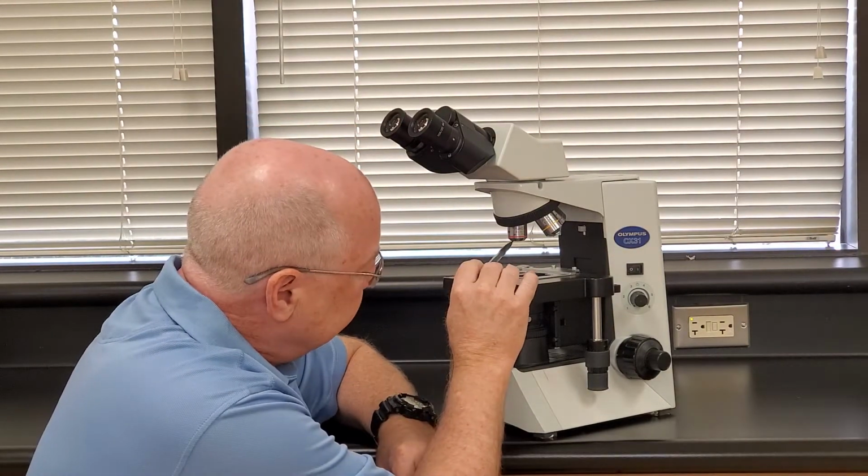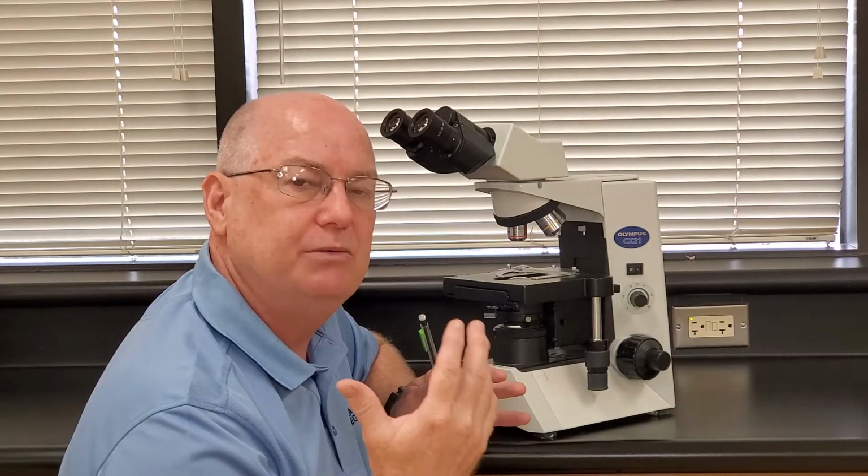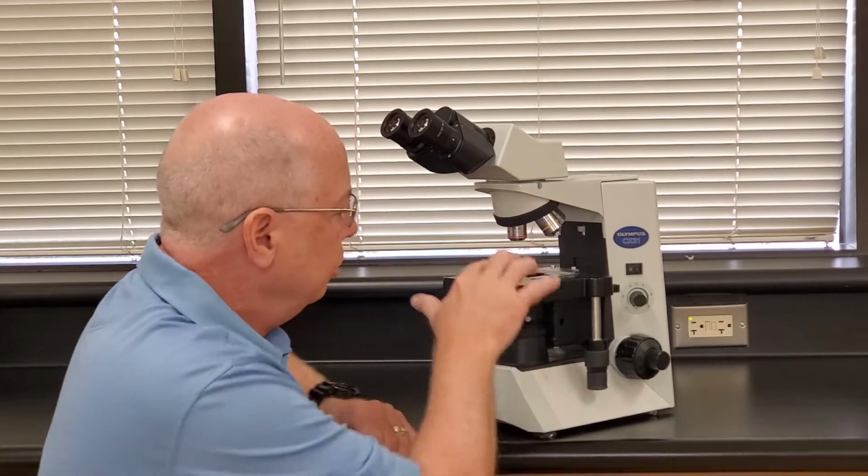The red objective, the smallest one, has a 4x. What it means is the piece of glass in there, called an objective lens, has the ability to magnify objects to appear 4 times larger. Whatever's sitting on this stage will look 4 times bigger.